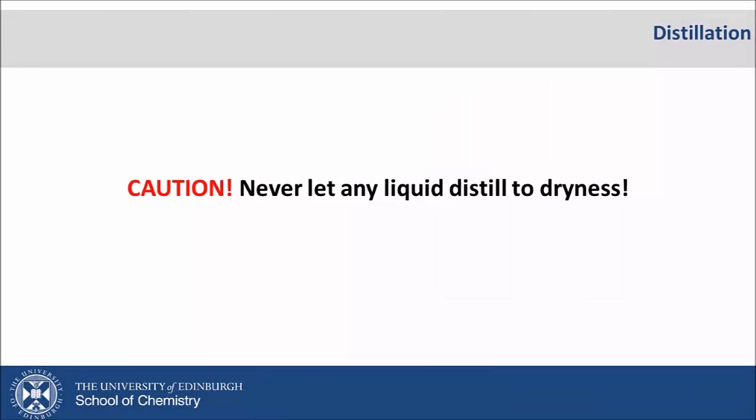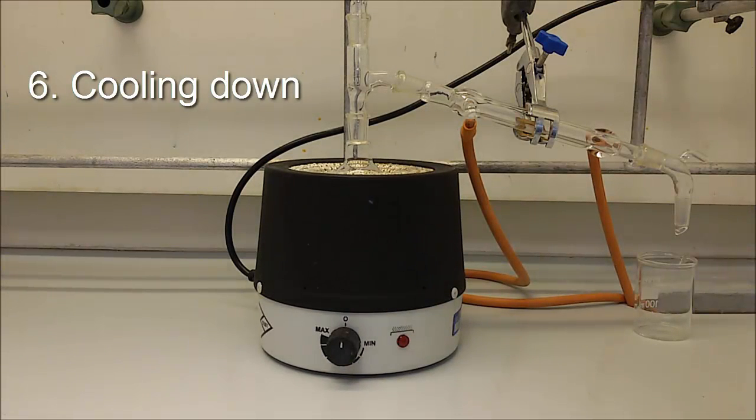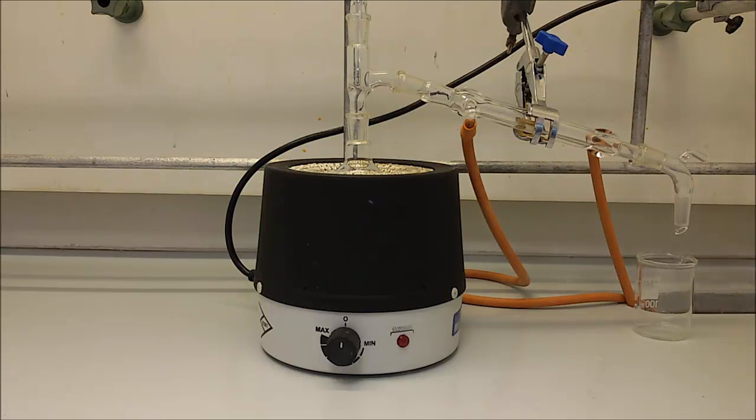Please take great care not to distill any liquid to dryness, as this may lead to explosion. Switch off the heating mantle when there is still significant amount of liquid in the flask, as it will still boil for some time after you switch the heating off. Aim to leave 3-4 ml of liquid in the flask.